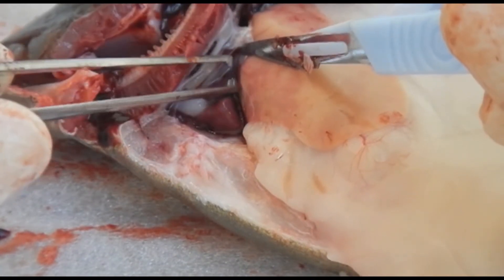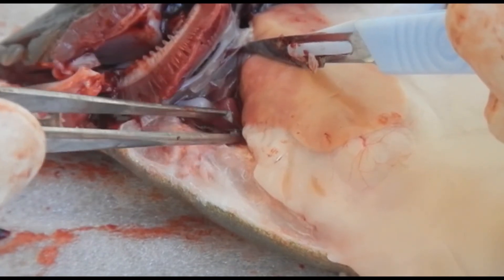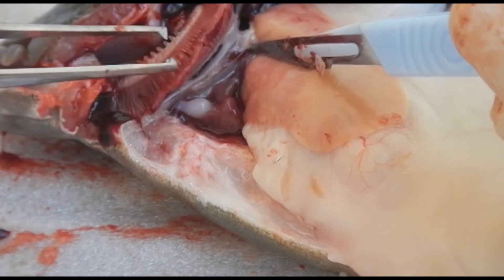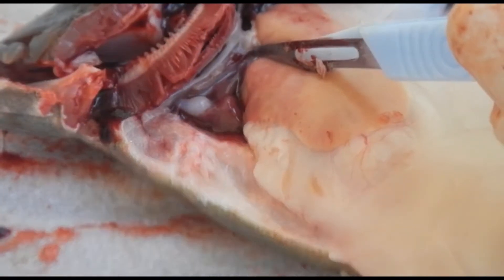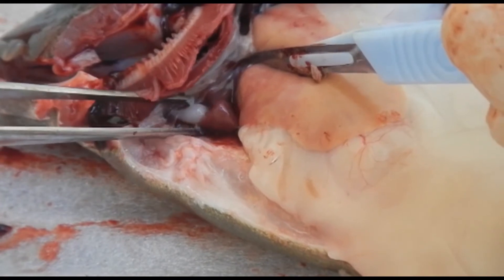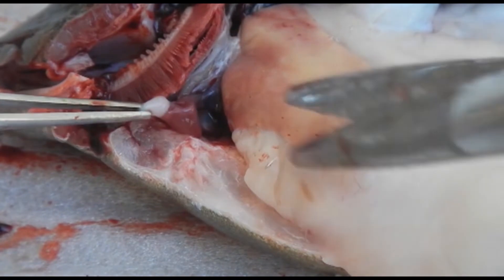The sinus venosus collects all the blood from the peripheral circulation. The atrium grabs that blood and pumps it down to the ventricle. The ventricle pumps it to the bulbus arteriosus, which is made of elastic fiber. Instead of having a pulsatile motion, it sustains the pressure so there is more even pressure for blood passing through the gills and the rest of the body. Now we're dissecting away the heart to place it in formalin for histology testing.